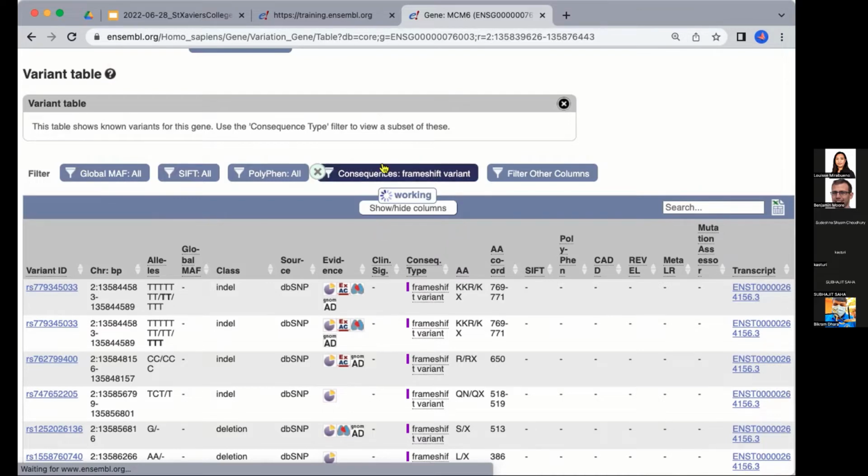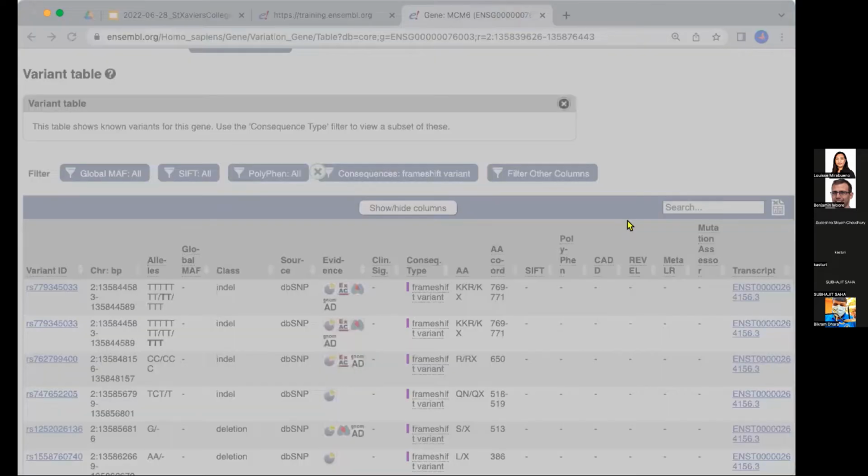Okay, I was just going to show you how it looks if you were to download the table. Basically, you can click it, and then you can choose different layouts that you want, how you want to download this table. Oh, there you go. It opens your system viewer, and then you can save it on your local machine. I'm not going to save it, so I'm just going to click cancel here.